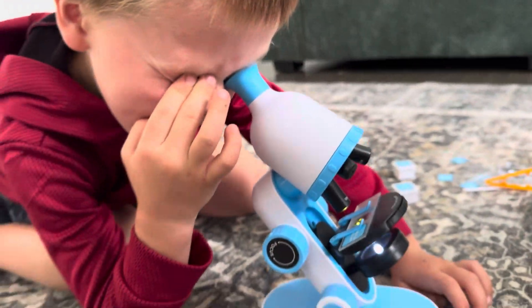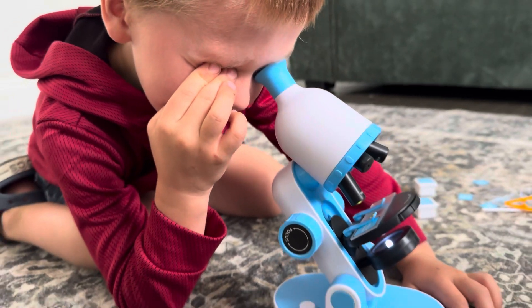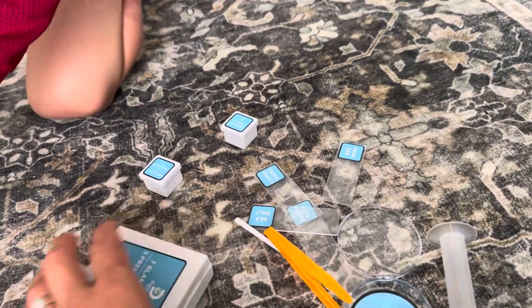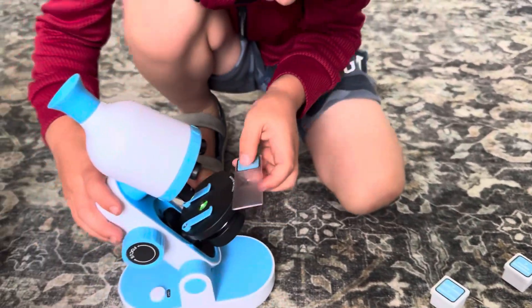Oh my gosh, do you see it? It's the camellia pollen! It's an amazing microscope guys. If you're looking for a great microscope, check it out — it has amazing tools right here. So let's try the sea salt, let's insert it.